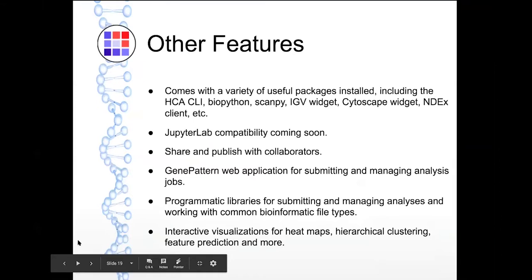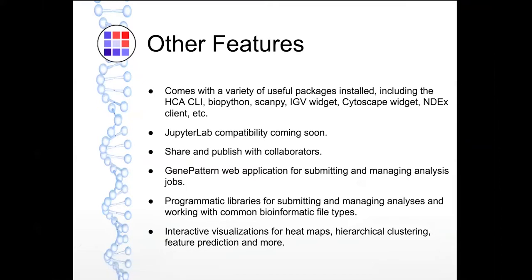I also want to note that the HCA Notebook Workspace and its associated frameworks have more features than I had time to demonstrate in this webinar. The workspace comes with a variety of useful programmatic libraries already installed. These include the HCA client, BioPython, Pandas, Plotly, scikit-learn, the interactive IGV and Cytoscape widgets, libraries for managing analysis jobs and working with common bioinformatic file types.